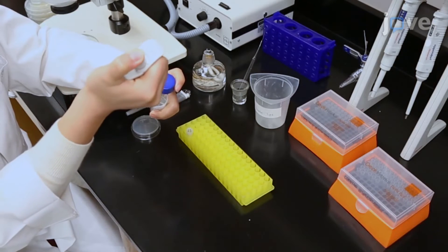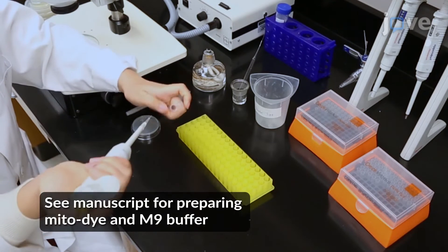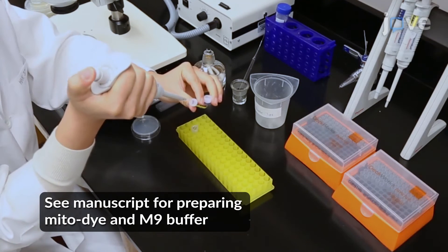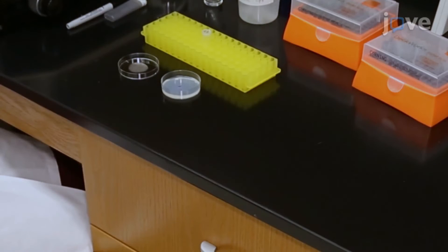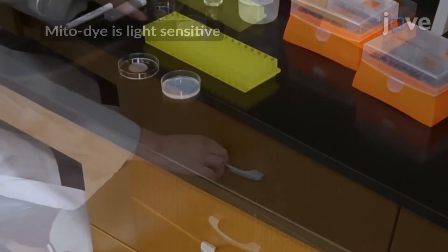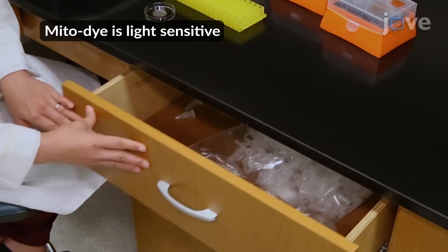Mix together 2 µL of 1 mM mitodye in DMSO and 10 µL of M9 buffer in a microcentrifuge tube. Pipette all of the mitodye solution onto the food dot on the male staining plate. Place the plate in the dark to dry for 30 minutes.